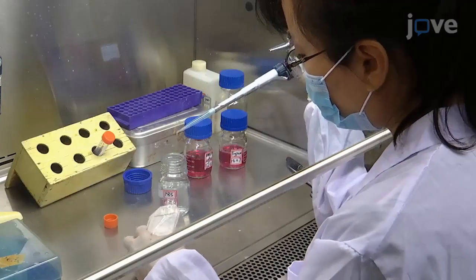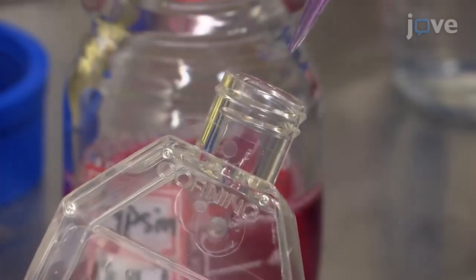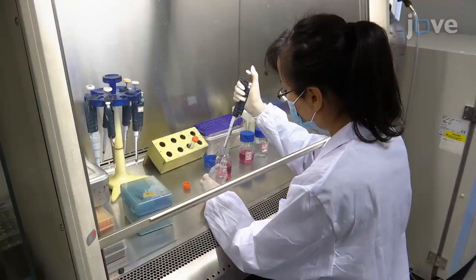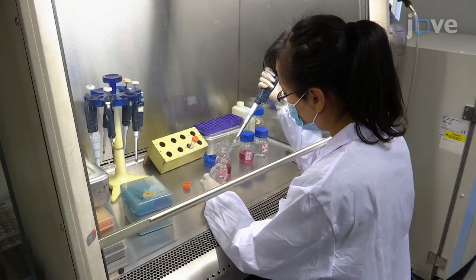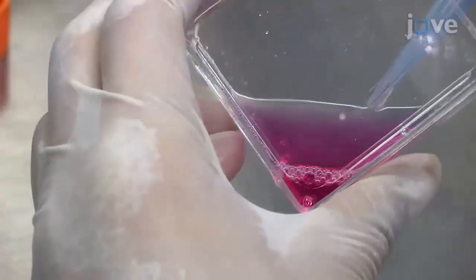wash the culture with 1 milliliter of PBS before treatment with 1 milliliter of 0.25% trypsin for 1 minute. When the cells have detached, stop the reaction with 1 milliliter of culture medium and pipette several times to generate a single cell suspension.